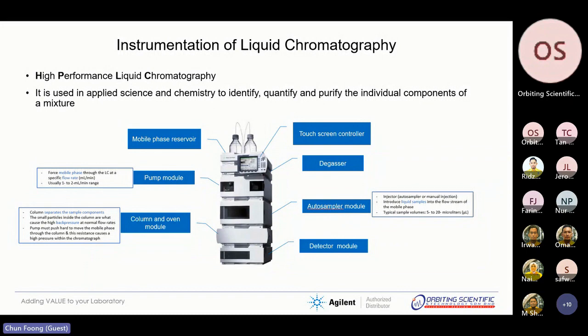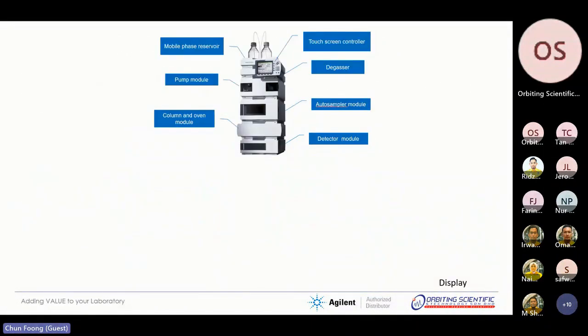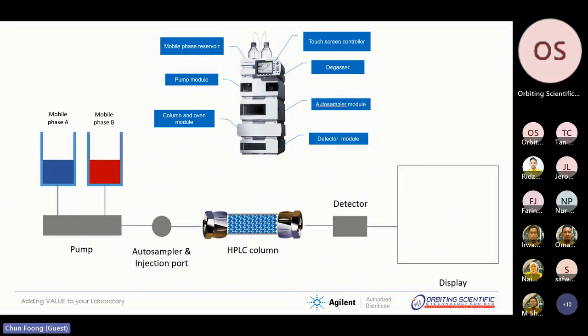When we run the HPLC system, we always want to know the column pressure and also the system pressure. After the column, the analyte goes to the detector, so that the analyte eluted from the column can be detected. The detector gives an output to the recorder or computer, and we call the result a chromatogram. Please allow me to sketch this LC system as a schematic diagram, a very basic, rough one.